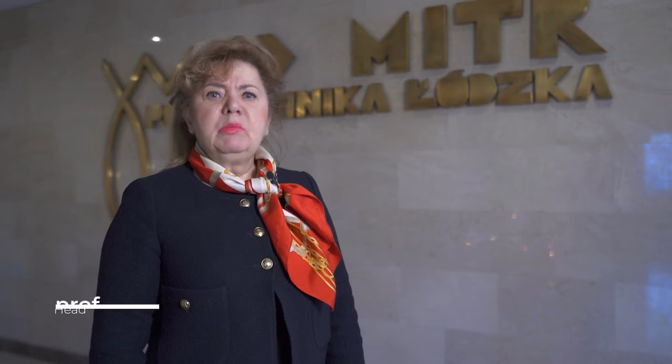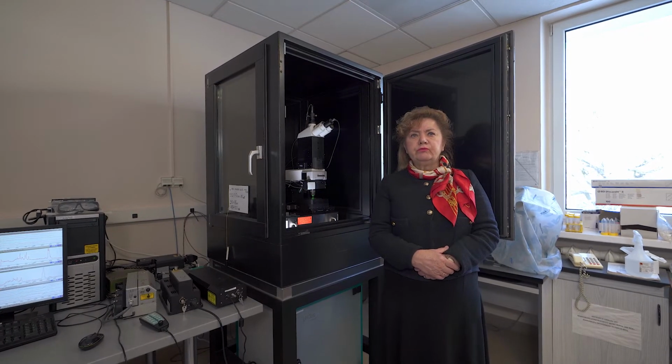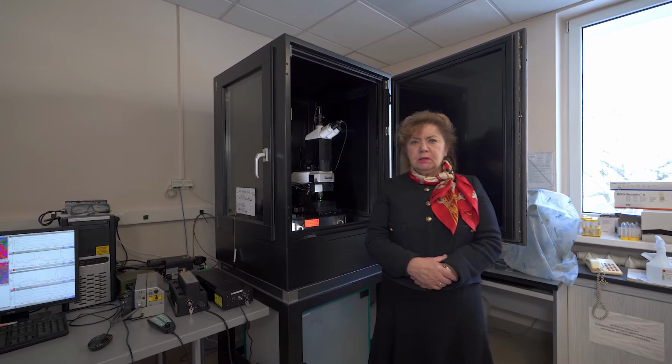We are in the laboratory of laser molecular spectroscopy of the Technical University of Łódź, and our laboratory consists of many laboratories using linear and nonlinear optics. We are involved in cancer and immunology research, and I will show our laboratories. We are in the laboratory of Raman imaging.